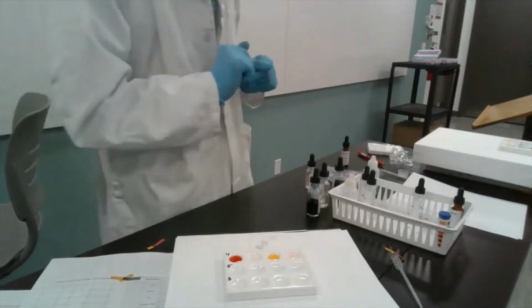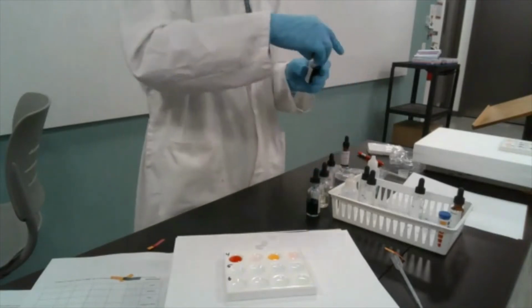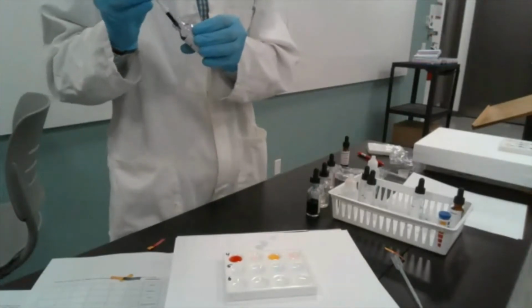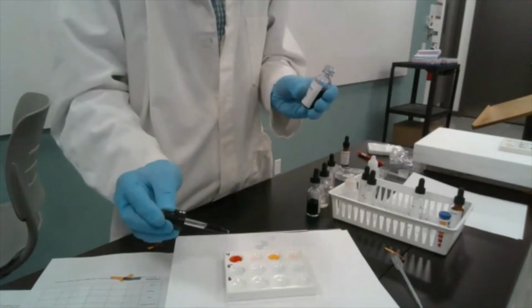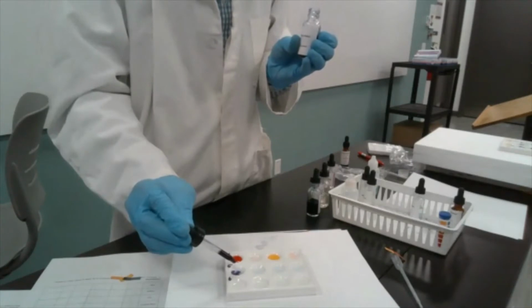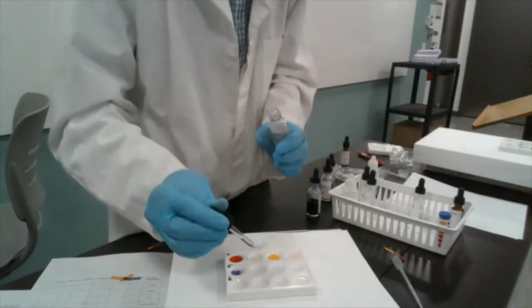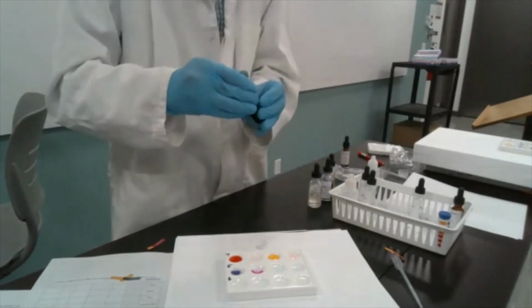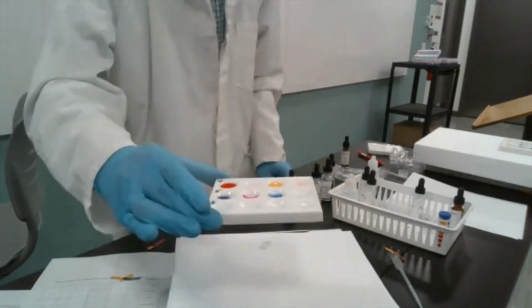So let's look at number 5, which is glass cleaner. Again, this can be a bit of a mystery to some people if you're not familiar with what exactly it is, but I mentioned ammonia, so that might give it away as far as your prediction goes. But let's see what happens when we add the indicators. Again, starting with the blue litmus. Then phenolphthalein. Finally, bromothymol blue.